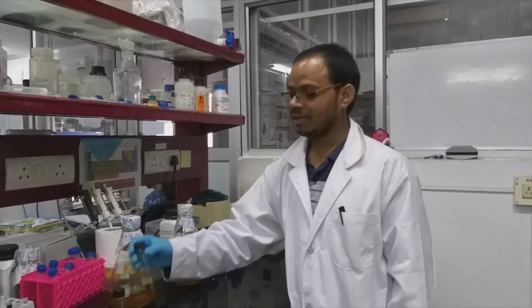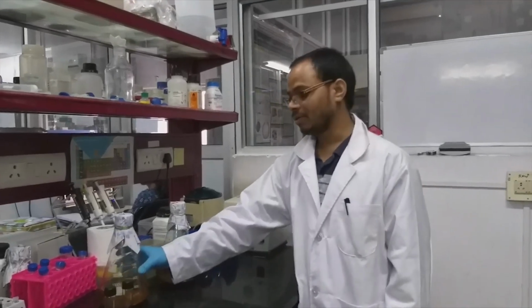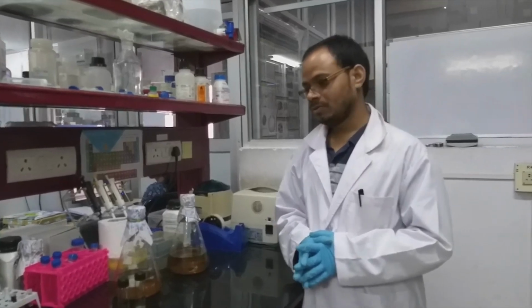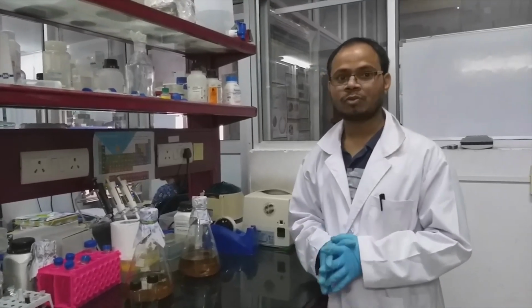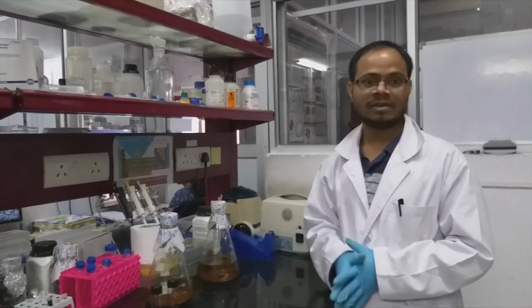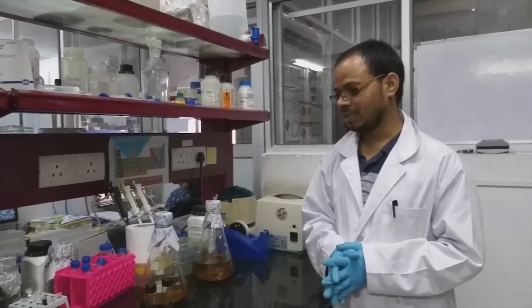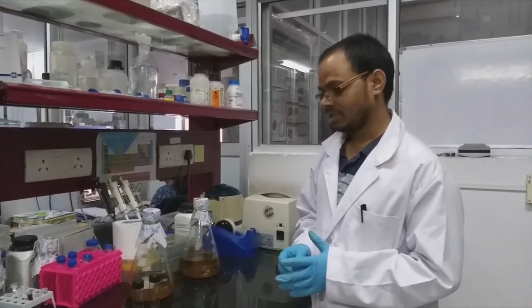This is the single colony grown overnight culture, which we can use for inoculating into large cultures. This process should be done in aseptic condition, which means we have to use laminar airflow. We also have to remember to include a suitable resistance marker like ampicillin or kanamycin, depending on what vector you have. In this case we are using ampicillin as the antibiotic. So let's start.